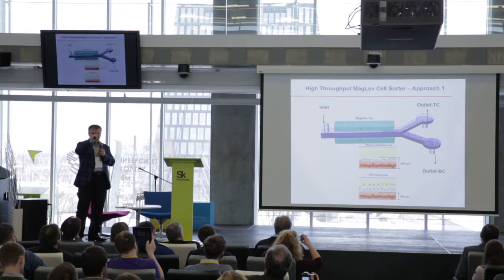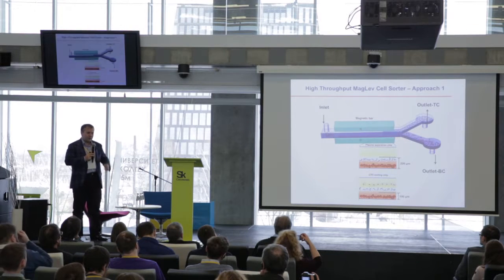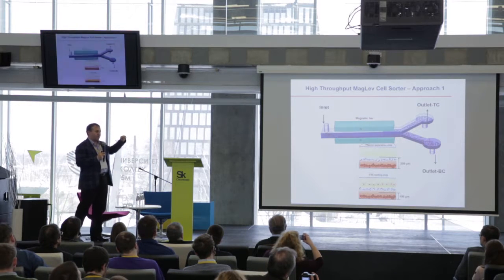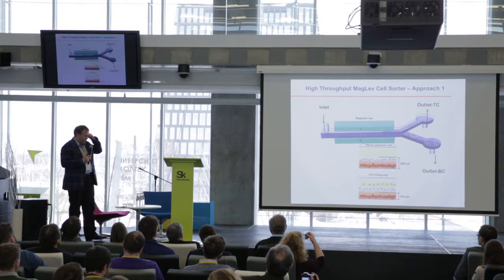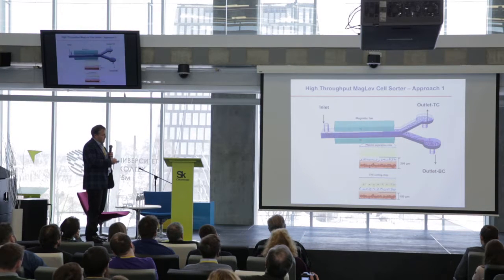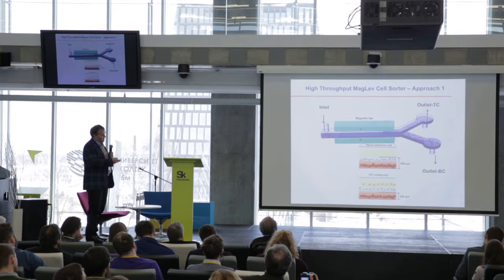So it's great to have worked with a microcapillary that takes about 50 microliters of blood. But my lab is at Stanford, at the Early Cancer Detection Center. If you are going to really detect cancer early, you have to process a lot of blood. So for that, we had to turn this system into a high throughput system, and we have quite a bit of expertise in microfluidics. What we ended up building was a system that would send the blood in, go through our magnetic gradient, and then have a wedge that would initially separate serum, white cells and red cells, and then if the cancer cells are above, they would be collected over here.